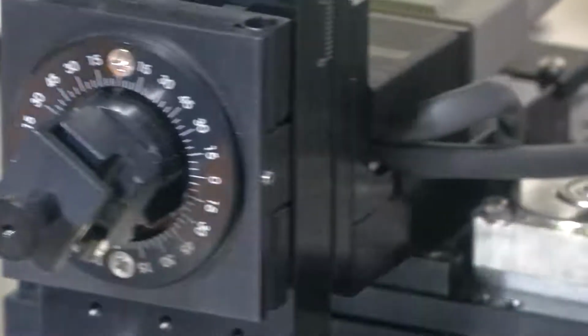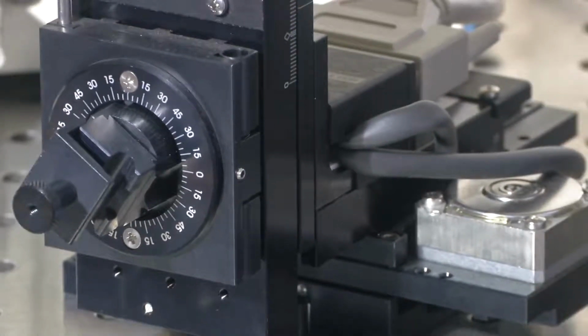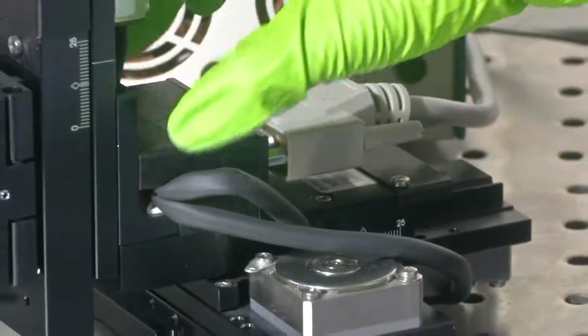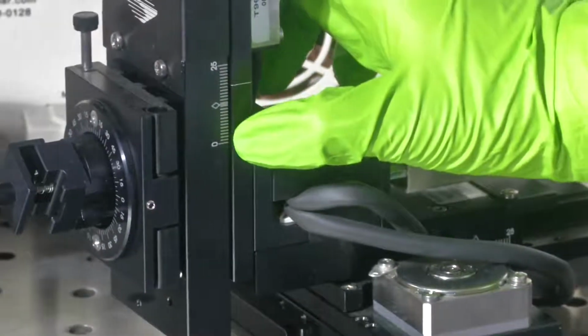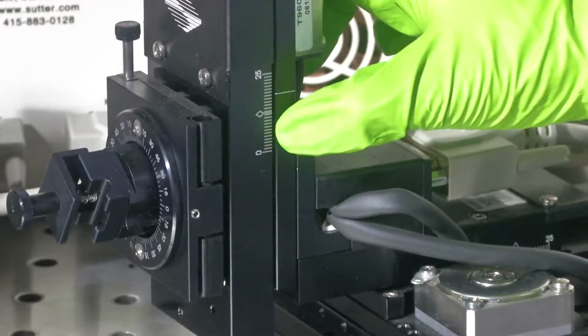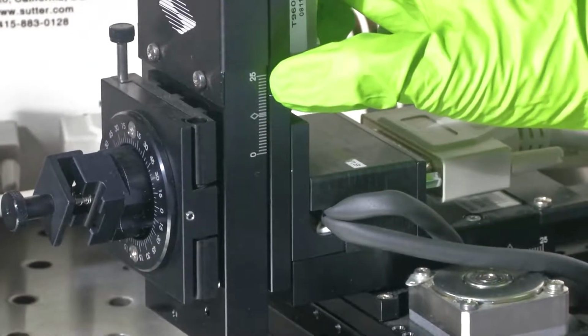And what is the precision that this manipulator could provide? If you can see here, it is mentioned 0 to 25, which is 2.5 centimeter, or 25 mm.